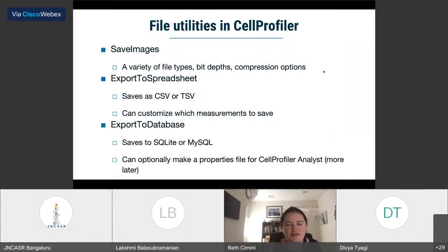Eventually, once you've put together this nice CellProfiler pipeline that finds the objects that you care about and measures them in some way that's interesting, again, whether that's count or something really sophisticated or both, we let you then save out images so you can create the outline and overlay images that I showed you earlier. And we, in fact, are really adamant that you should nearly always do this, because there's nothing more heartbreaking than thinking you found a cool quantitative result and then going back to the outline images and realizing that it is actually a result of poor segmentation.